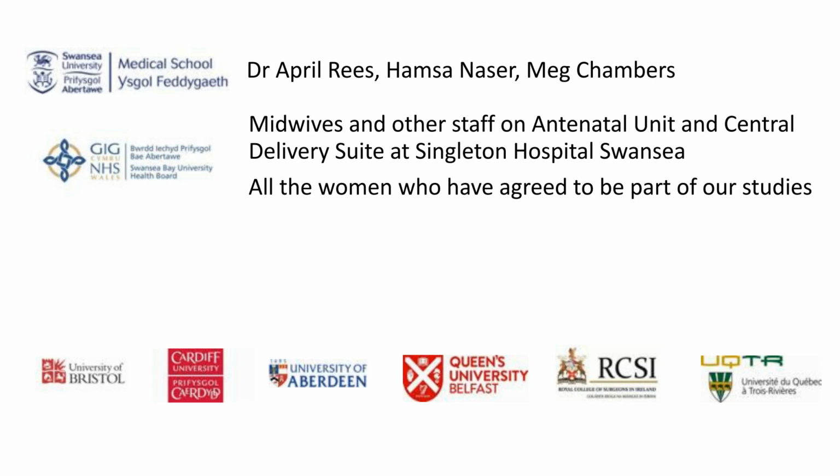We would very rarely get anything less than that, and we would probably not take it through to any of these analyses if we did. And then the number you need really depends on the platform that you're on. Because we work in pregnancy, you can't get vast amounts of blood. We get about 30 to 35 mils of blood from our pregnant women. We do work with umbilical cords and finger pricks and heel pricks as well. So we've tried to do things that don't need very many cells.